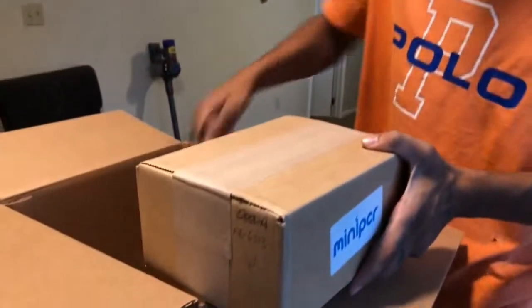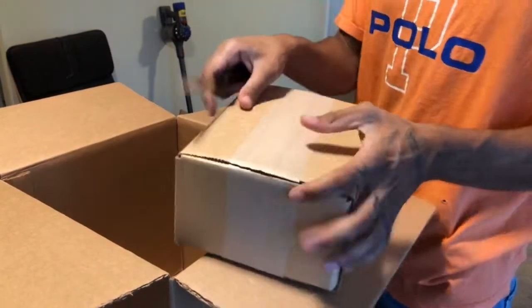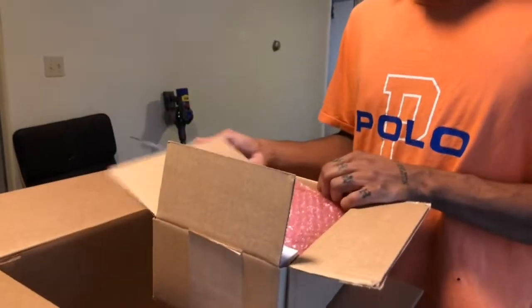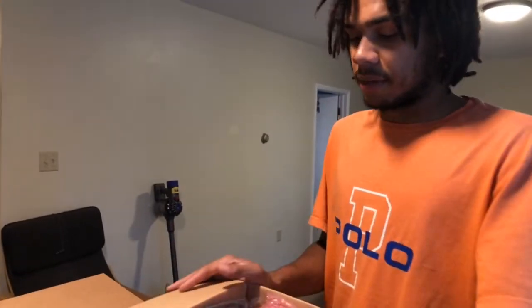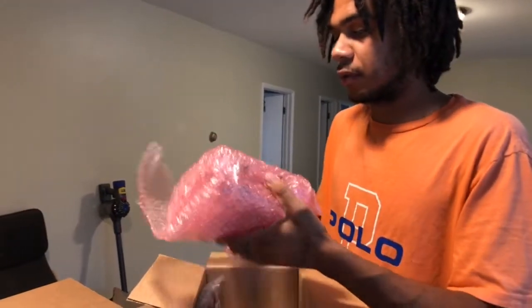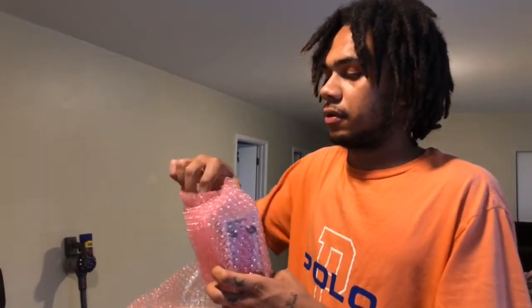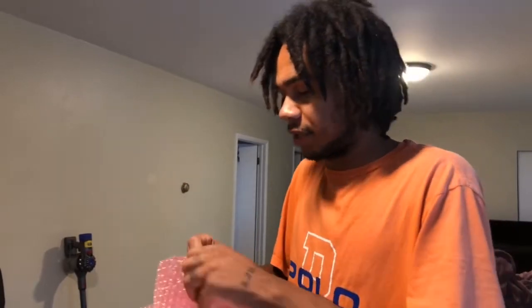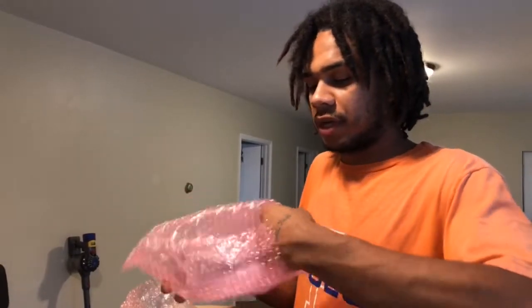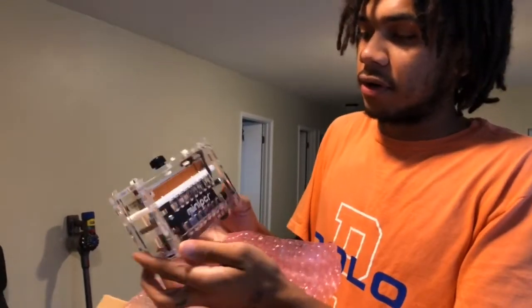And there it is — the crème de la crème. I did have another PCR machine, but it's a really old model. A lot of people end up getting old used lab equipment just to keep it affordable, but it's really cool that we can get a new piece of equipment that is also very affordable. This is the polymerase chain reaction machine, and it also works as a heat block, so we can use it for incubating as well as DNA amplification. And there we have it — our mini PCR.